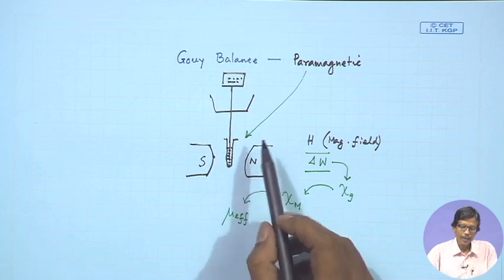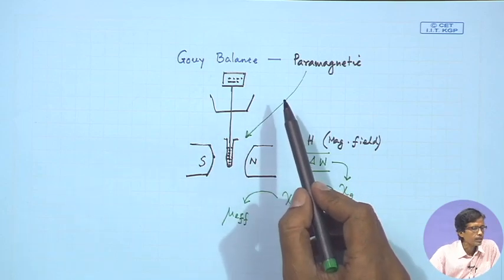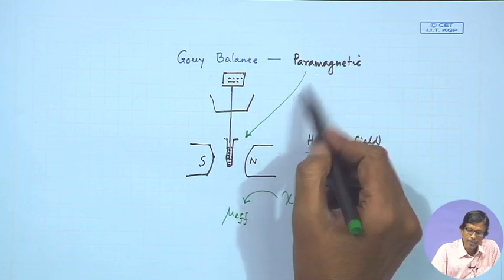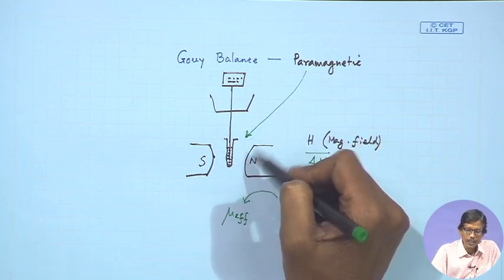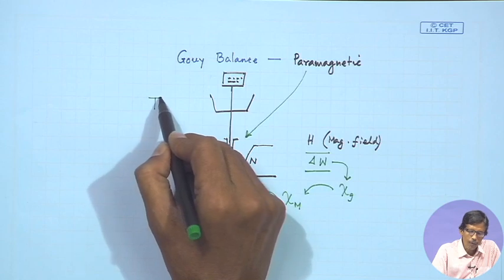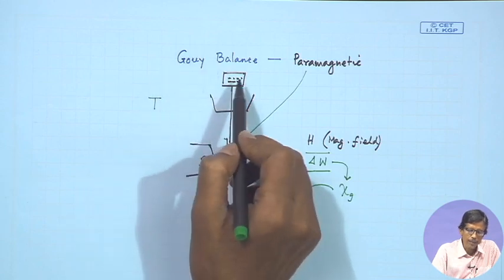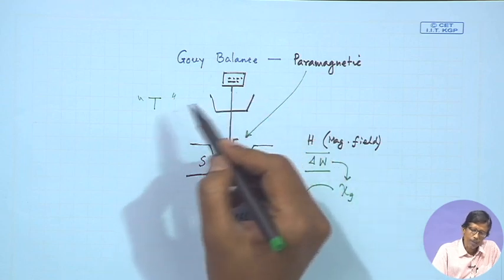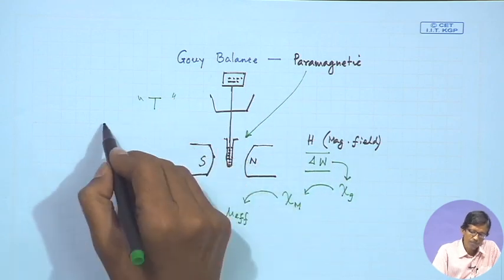So, it is nothing but a very simple thing: instead of doing the temperature effect, we measure in the presence of a magnet. Now, if we make this a typical arrangement where we can also see the temperature effect, that means you have the thermobalance.